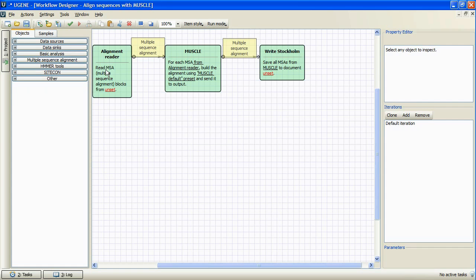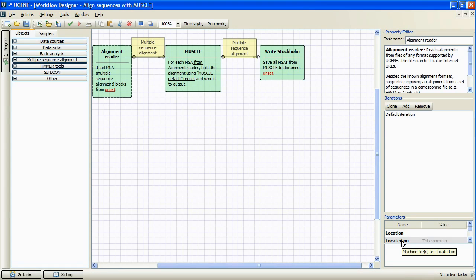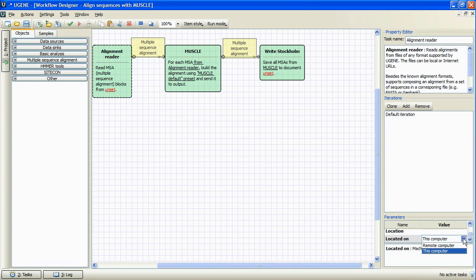Let's specify the location to read MSA blocks from for alignment reader. As we can see, we can specify the type of location, local and remote computer.